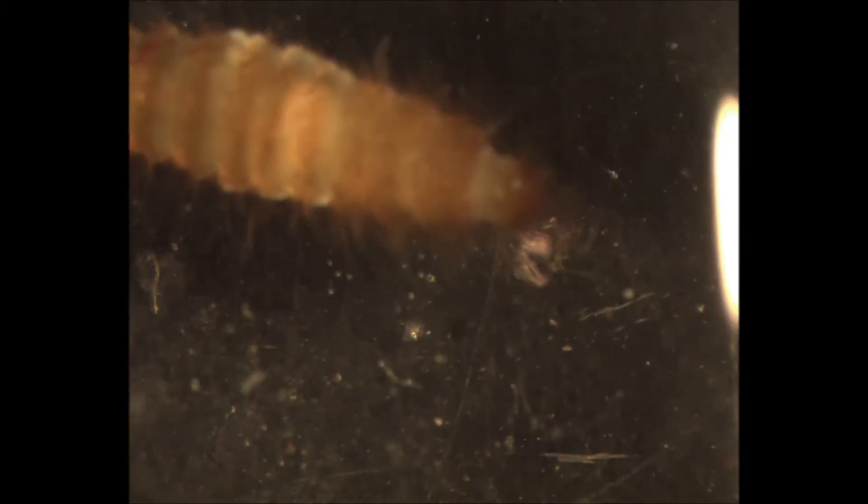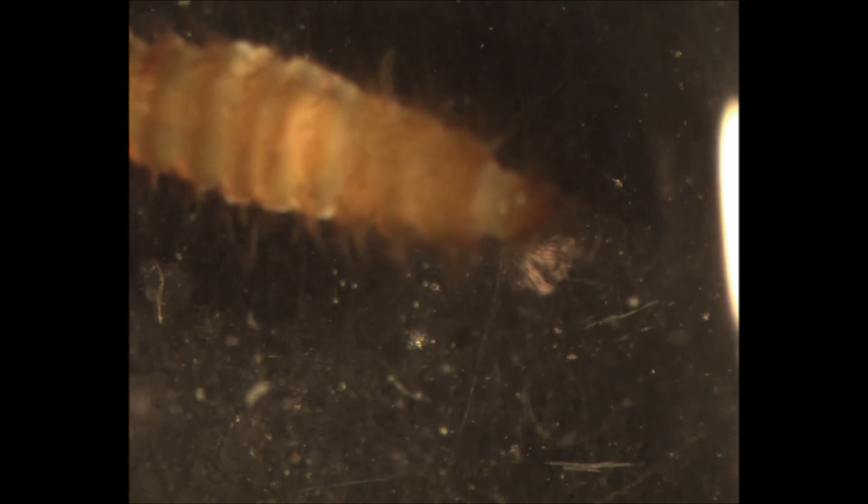I'll back out and begin work on the specimen. It's partially cleared, and I'm going to finish the clearing process by taking off the head and hind section of the larvae and clearing it out with distilled water before moving it on to put on the slide.